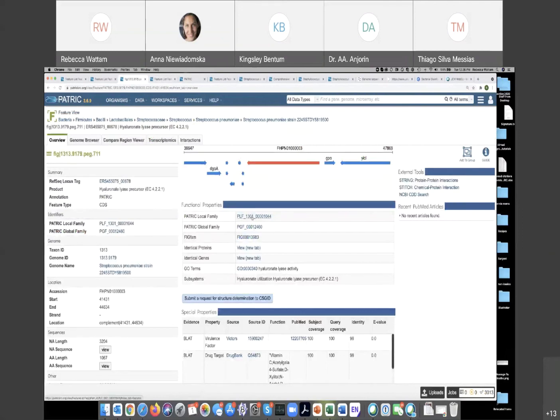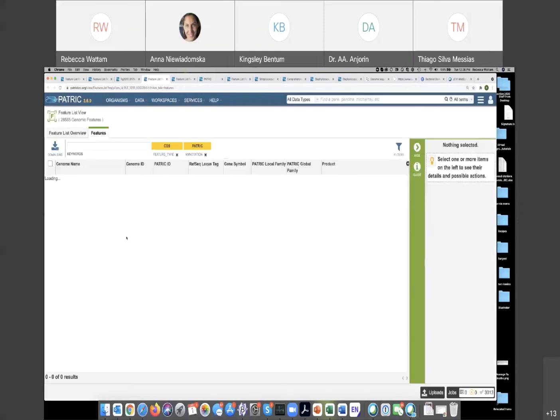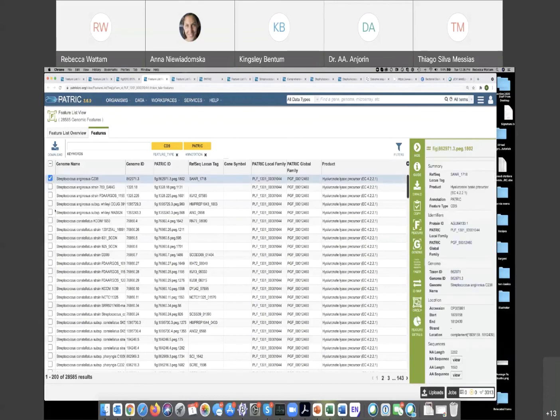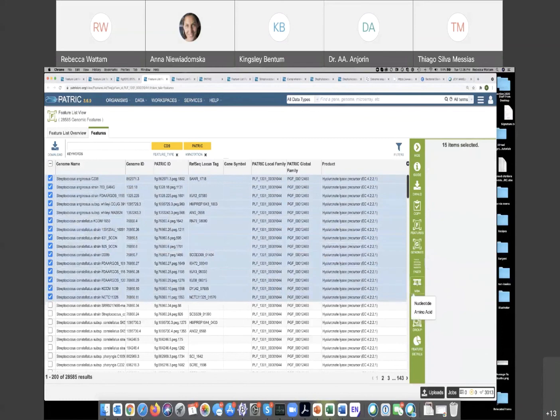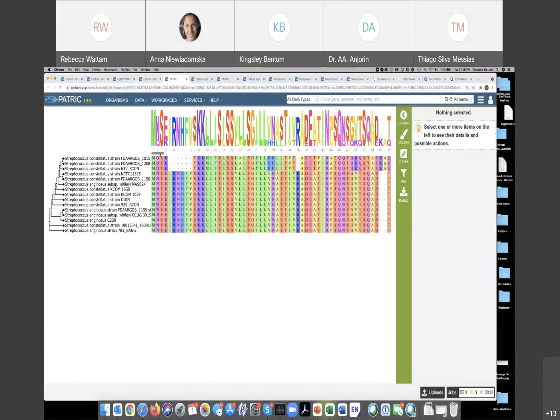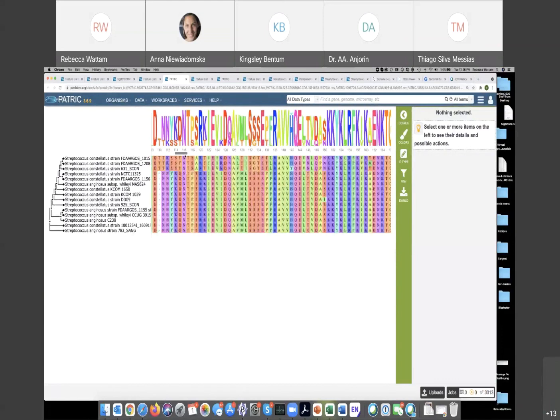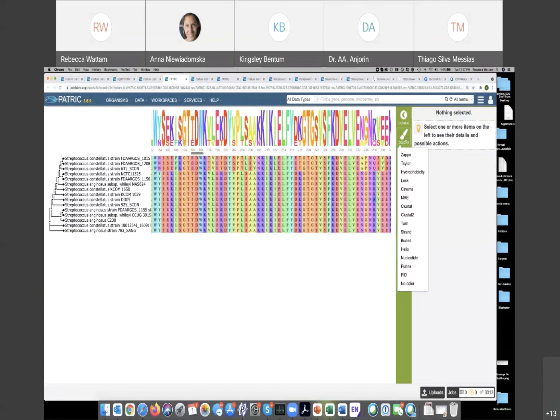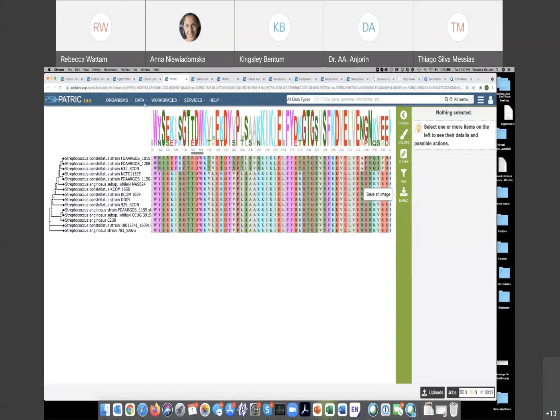In the local families, just in Streptococcus, how many are in this? So it's a lot bigger, right? And if I choose just another subset, I could launch the MSA, the amino acids. And then you can see getting a little bit more noise here, but it's just so pretty. And you can change the colors and stuff if you like.